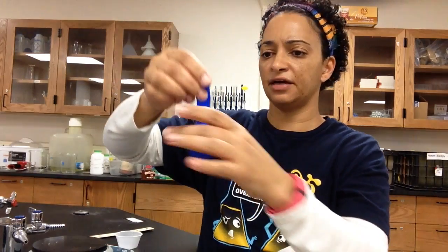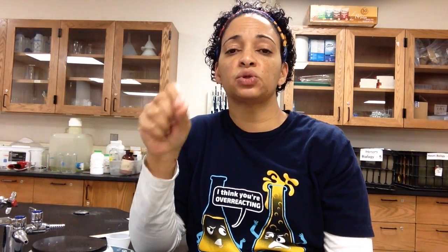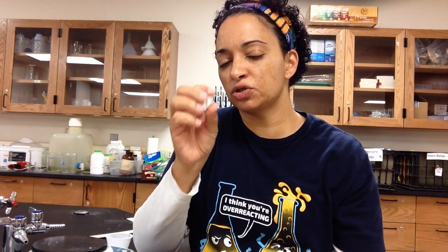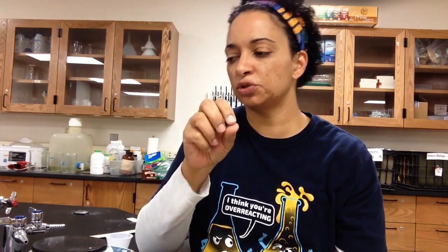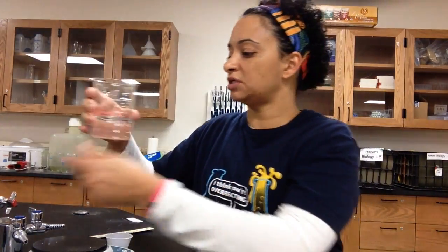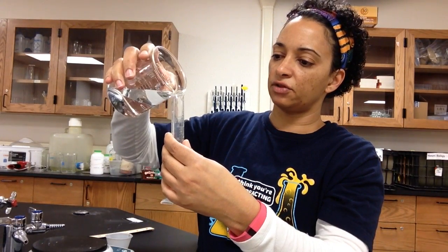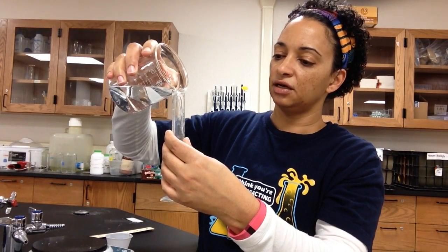Now I'm going to go ahead and get my glucose solution. All of your sugar solutions are hanging out in a water bath because we're trying to keep them at a certain temperature — yeast likes warm temperatures, so we want to make sure your solutions stay there. I'm going to grab my glucose container and measure out 25 milliliters of glucose using my graduated cylinder.